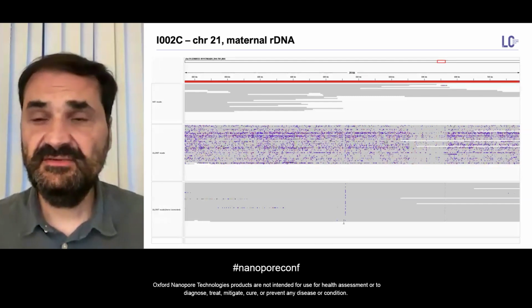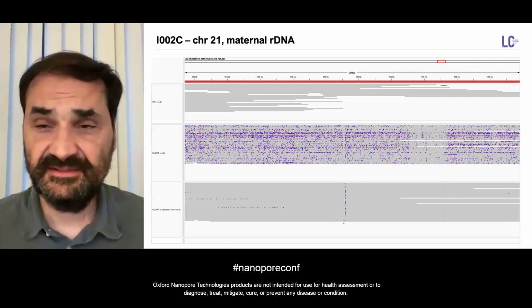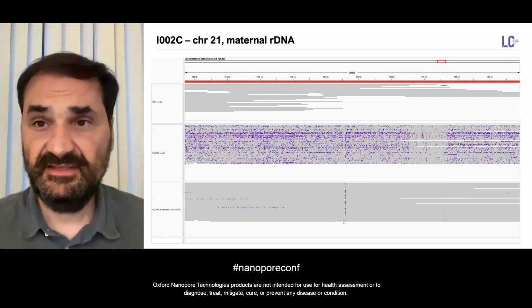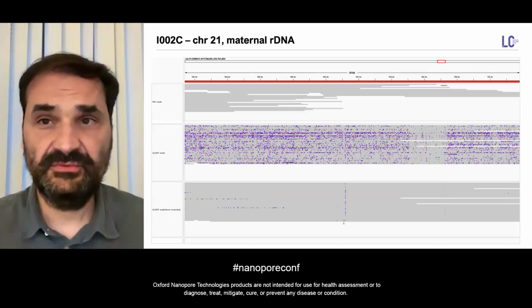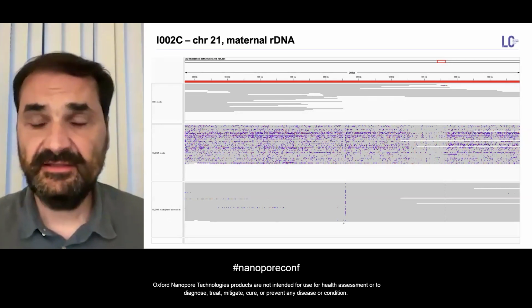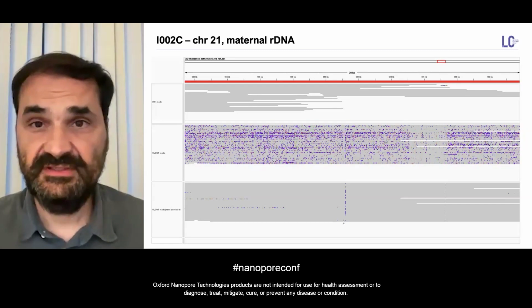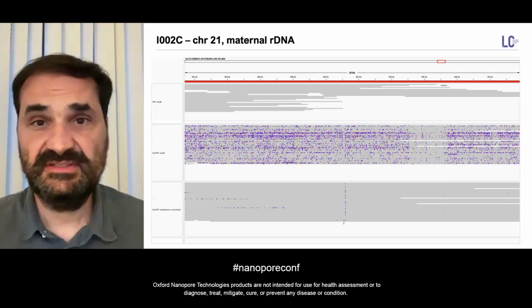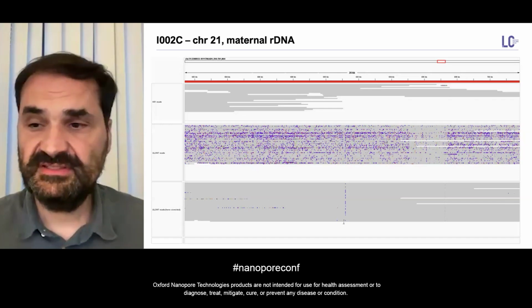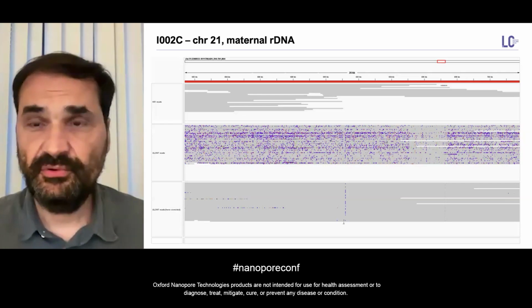Here you can see very interesting regions. So rDNAs, the rDNAs are the last region we need to resolve. This is one of our rDNAs we resolved correctly for one chromosome on our Indian genome, and we try, and you can see here the error rate of reads when we try to map them to this region. In the first row, you see HiFi reads. In the second one, you can see Nanopore ultra-long reads.